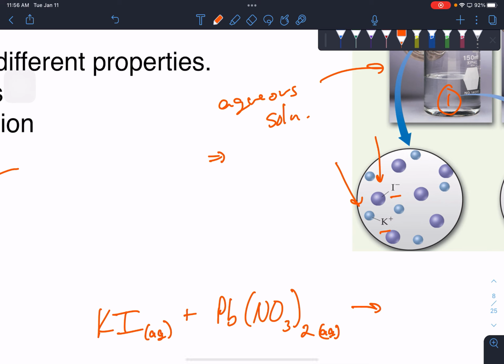If you have a different solvent, what would you use for the subscript? You know what? I'm not sure, to tell you the truth. I don't think you would use AQ. Within the context of the experiment, you may just know that the salt is dissolved in ethanol or something like that. Honestly, I can't recall the notation for an example where an alcohol is the solvent.